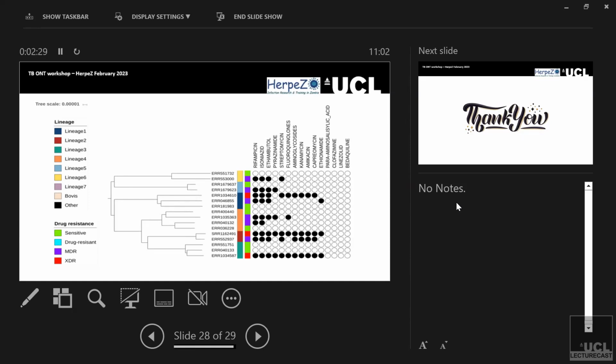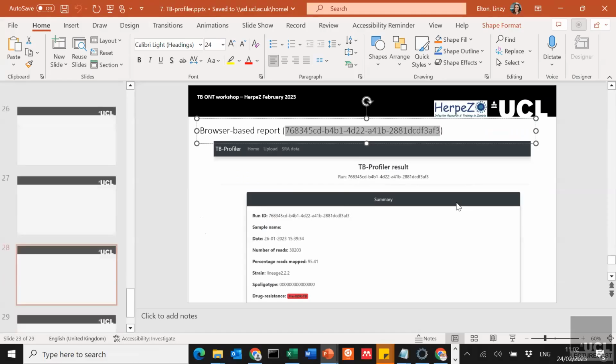So yeah, as I say, you've now got FASTQ files. So bear in mind that the FASTQ files that you've just done are one single file. What we can do is concatenate them together. So I can show you how to do that, I think, on this computer if I've got some. Or you can just upload the single file itself and just see what happens. What you'll probably find is, because it's one file, you won't get as much information as this one. But let me just see.